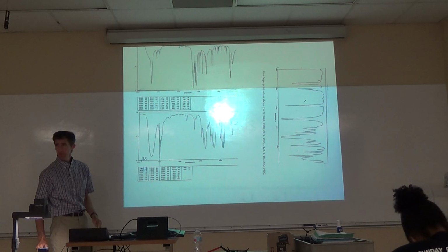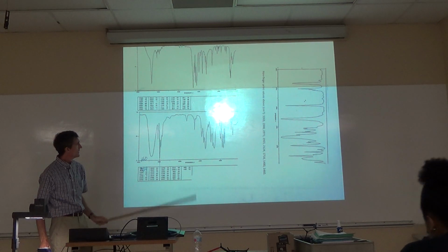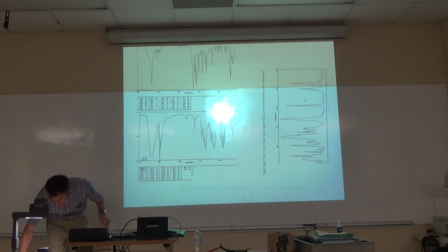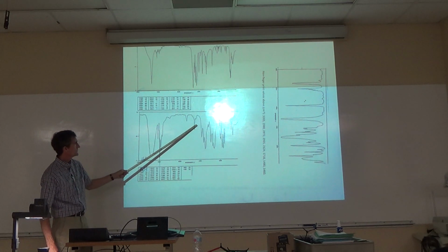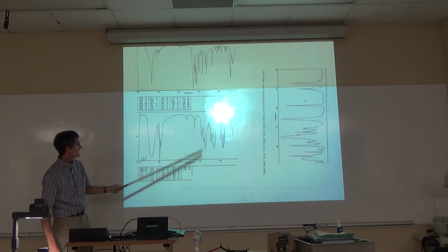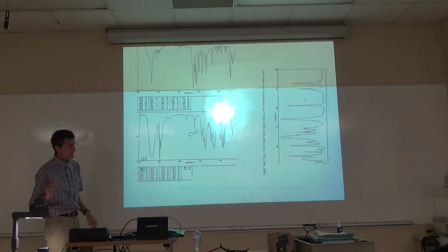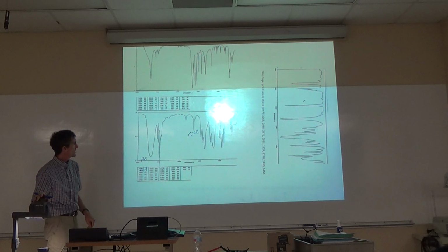It's almost alkene region, carbon double bond. Instead of C double bond O, C double bond C, which tends to be weaker. What is the value on that peak there? 1648. What's the one above it, 1645? Pretty close. It's either 1648 or 1645. It could be C double bond C instead of C double bond O. Mainly because it's weaker.